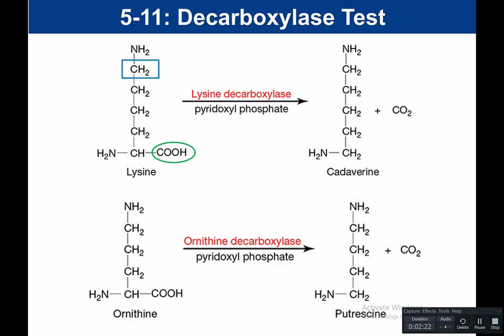And in our decarboxylase reaction, we're going to remove this carboxyl group. That is facilitated by the specific enzyme for lysine, which is called lysine decarboxylase. You'll see that abbreviated LDC. LDC stands for lysine decarboxylase. That enzyme is specific and it decarboxylates lysine specifically. It does not necessarily work against ornithine.